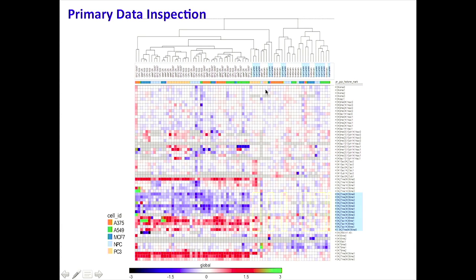And what I've done now is highlighted all of the curcumin replicates here. All of the replicates over here are all these EZH2 inhibitors. You can see they have quite a strong signature. In fact, curcumin doesn't have such a strong signature that mirrors that of EZH2 inhibitors. And so we're not really sure if we're onto the right thing here.